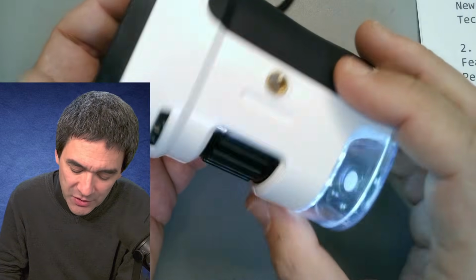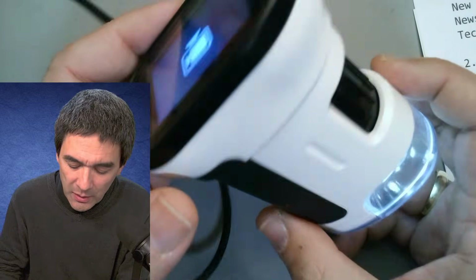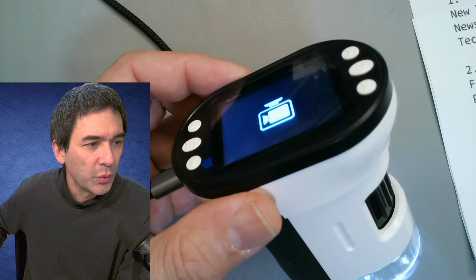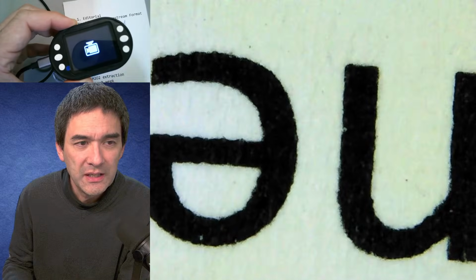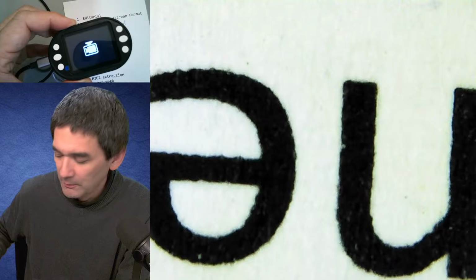But let's go back to this one over here. This is a USB microscope, and it's connected right now, and basically, if you just want me to show this to you, that's what you're able to see. Okay, yeah. I'm going to show you a couple of slides then, in a minute or so. But you see, it basically works, and you're able to see what I'm able to see as well.